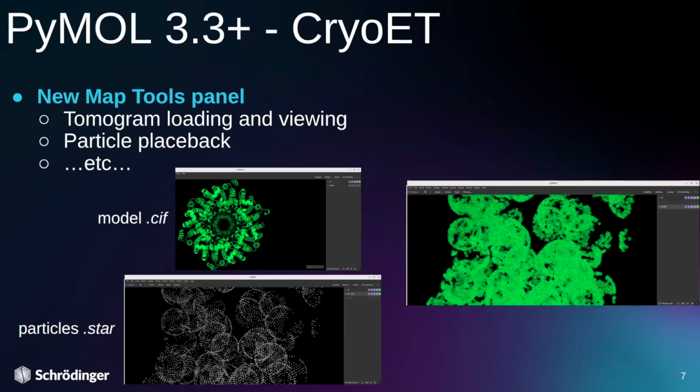There are, of course, some tricks that PyMOL will do to downsample the map so that it can be easily loaded in. But we have plans to, as you're viewing the tomogram, have the native resolution be visualized locally as you're scrolling through the view space.